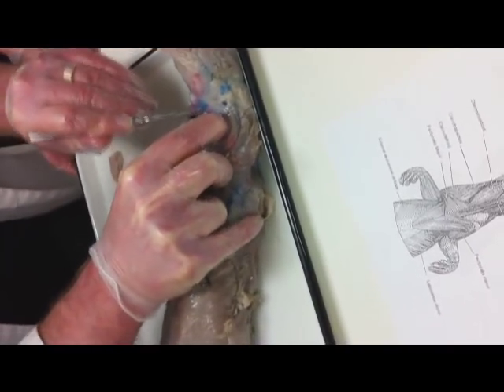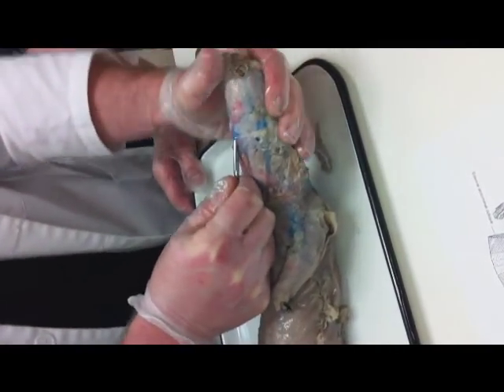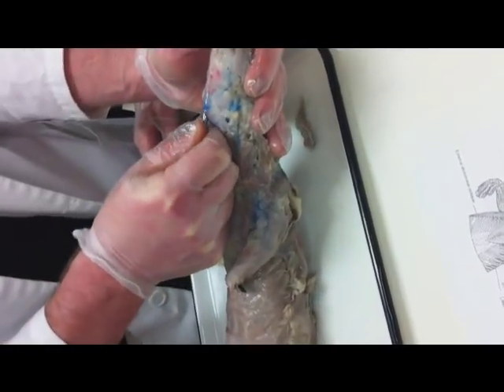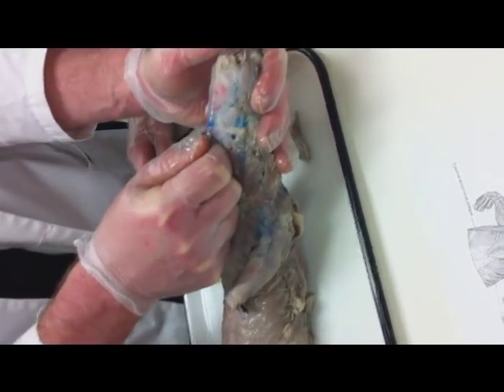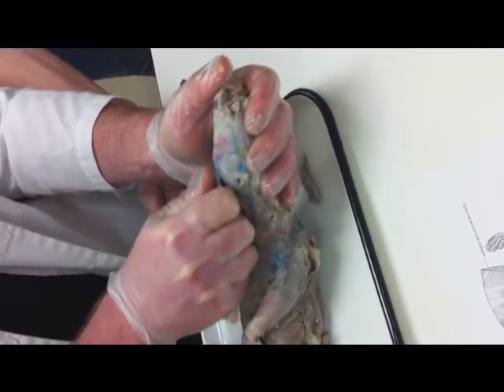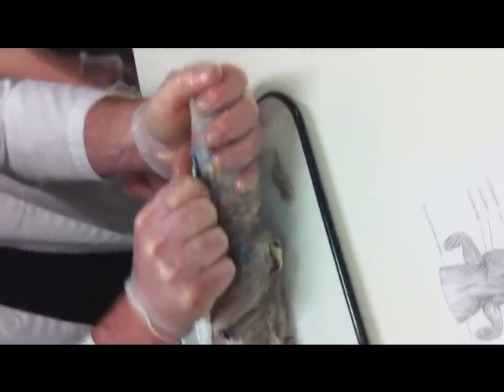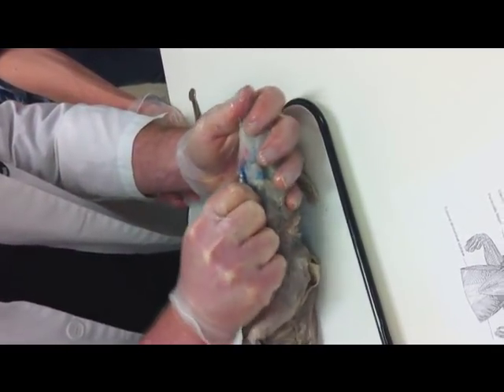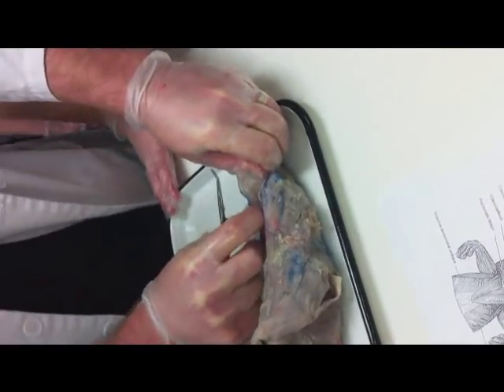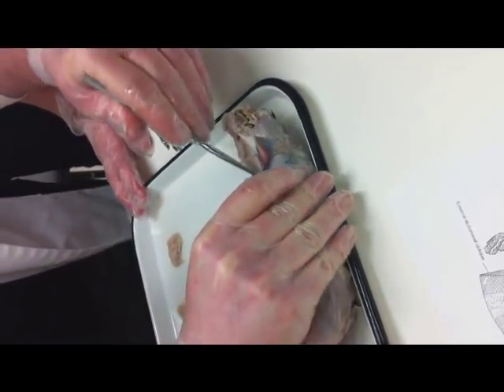As I probe further up, and this is where you border on brutality, you have to be careful. I'm putting this, you can see the probe, and I'm not going through brown, I'm going through clear. See? Because you can still see the tip. Do you know what I mean? Like I'm not tearing muscle. So I'm coming up here and I'm going to poke it right out below his jaw, sorry, and then I'm going to tear that. So give a wonderful ripping sound. Okay. And by tearing that apart, I've exposed his mandibular gland, which is here. That was on top previously.